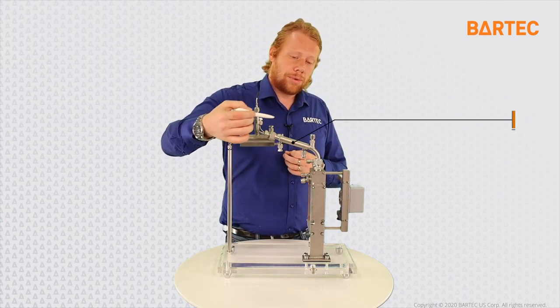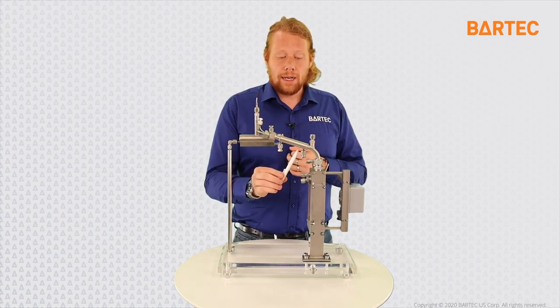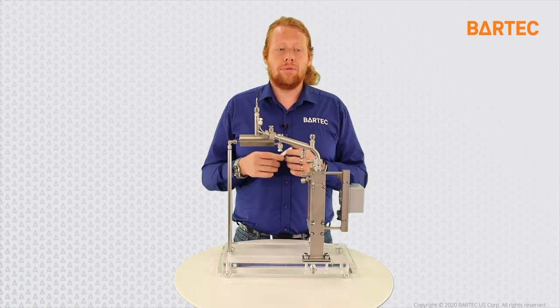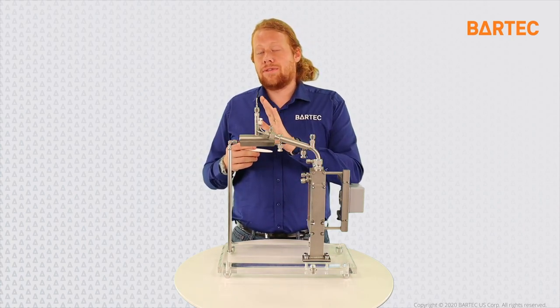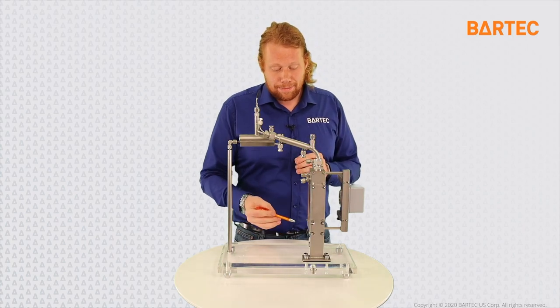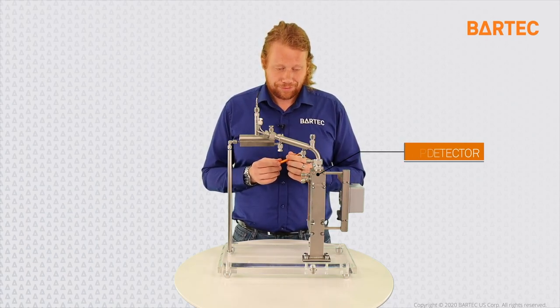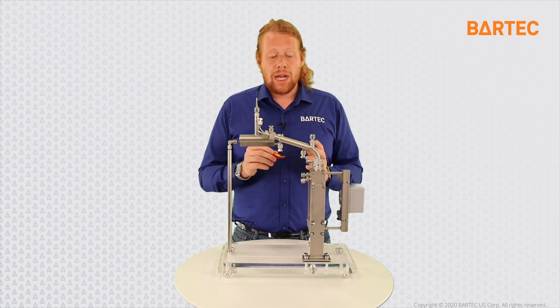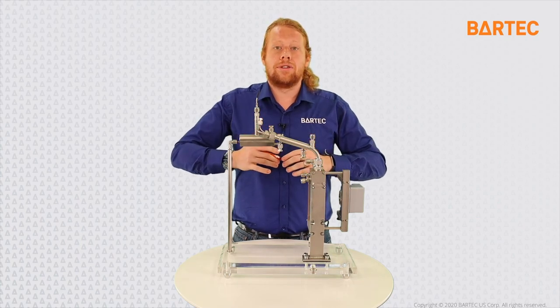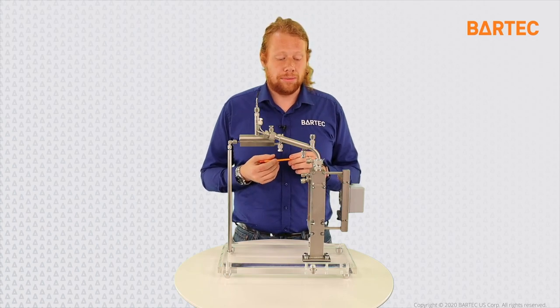The next component we're going to look at is the condenser. The condenser has an inlet for water and an outlet for, again, water. The water coils around the sample, thus cooling it and changing it from a gas phase to a liquid phase once it passes through. Inside this big aluminum block, we have an IBP, initial boiling point detector. This IBP detector will monitor the first drop of liquid that comes out during the distillation, thus giving a very accurate and precise measurement of the initial boiling point.